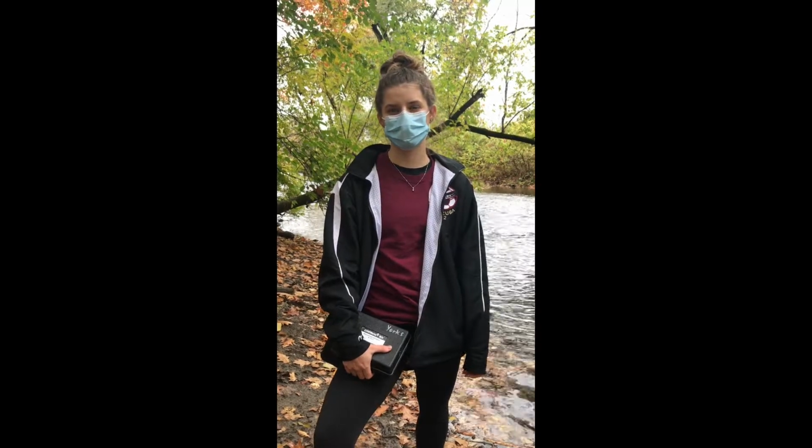Hi, I'm Taylor and I'm part of the bio program here at Cazenovia College, and today I'm going to be teaching you guys about how to measure dissolved oxygen found in lakes and streams.